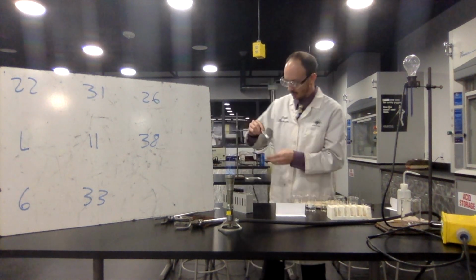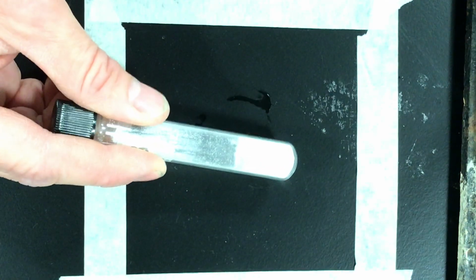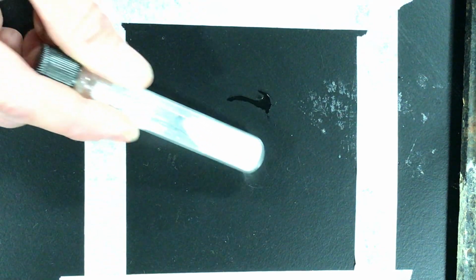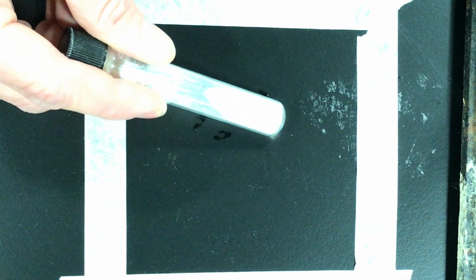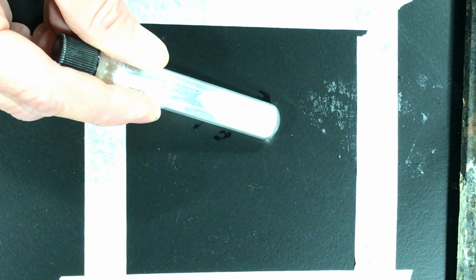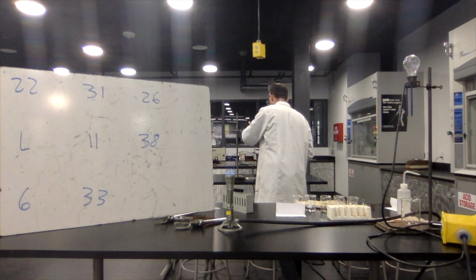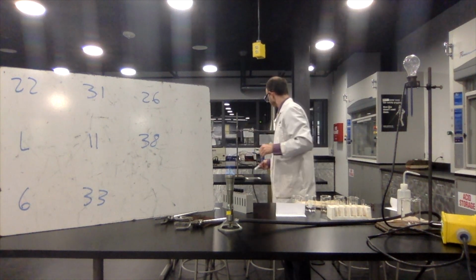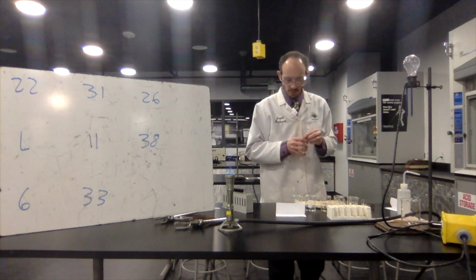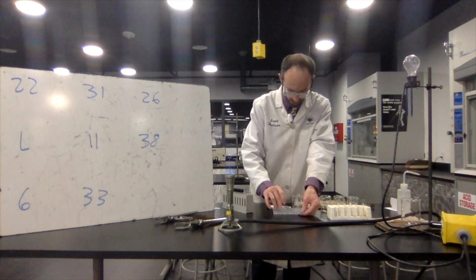Okay, so here's to show you this one. It is a white powder. Okay. No, it's not actually glowing in the test tube. I just cannot adjust the light very well. Okay. So now I'm going to take some of that white powder, put it across here.